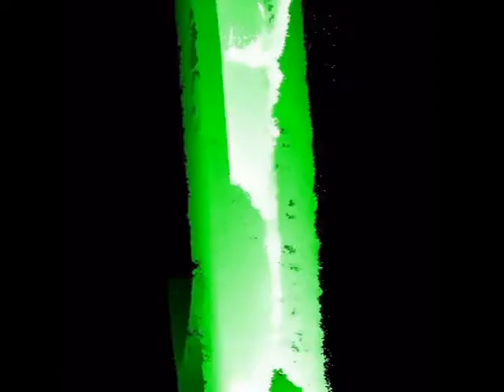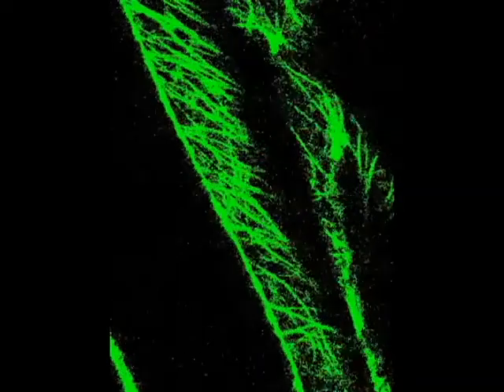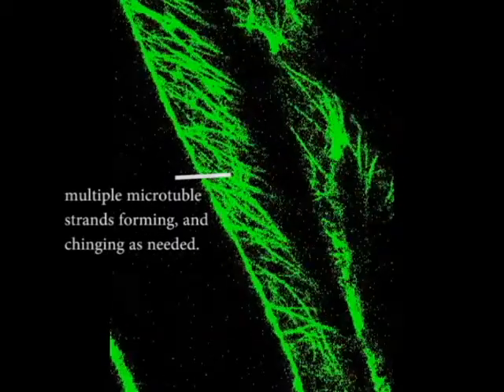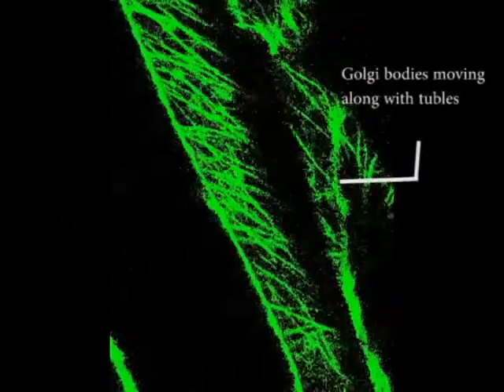The structure in the center is just a stem cell. The others on the side are side stem cells that were not fully constructed in the 3D imaging.